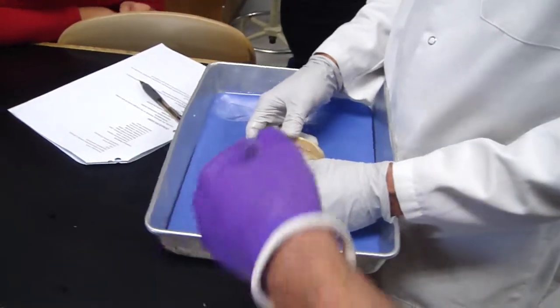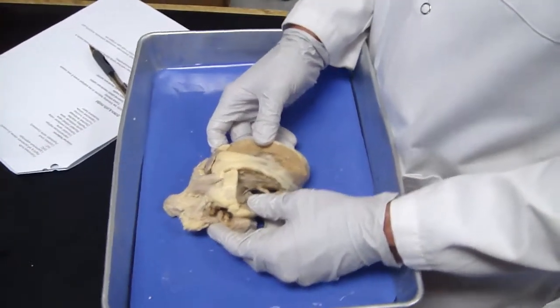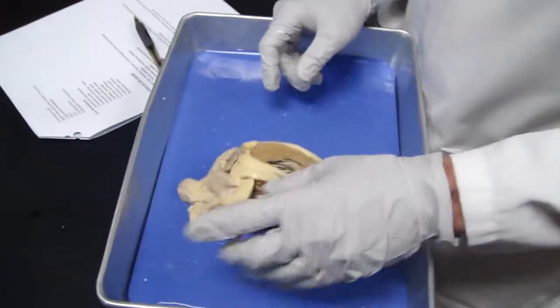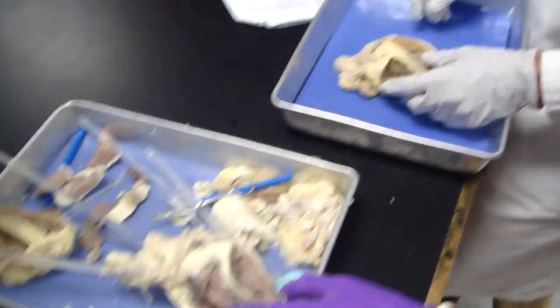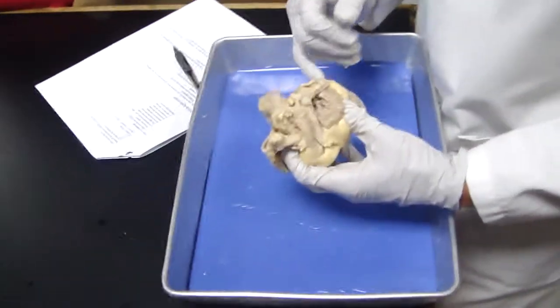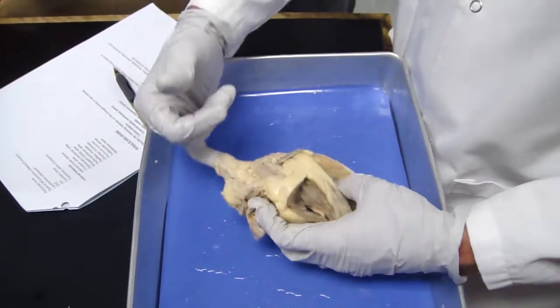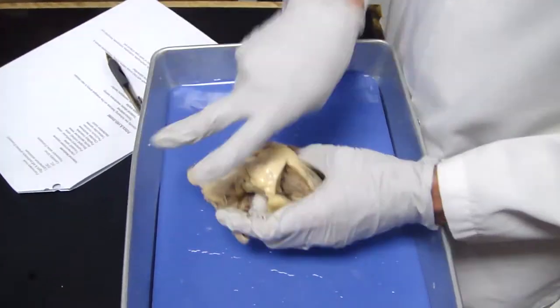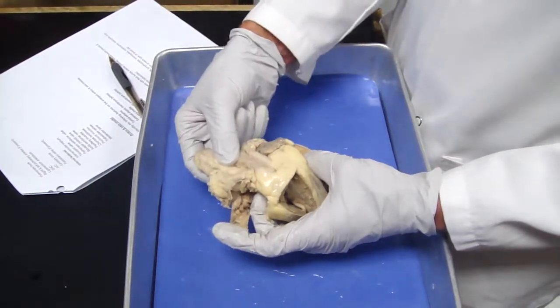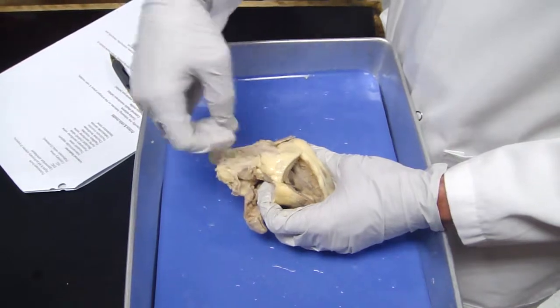Can you just show us, because I'm not sure if we're going to be responsible for veins and stuff. Great vessels that we can see, and I would use rods. So if I shove a rod in here, and you can see where it's poking out, and then I shove a rod here, you should be able to figure out, all right, this is aorta, and those two are touching, that's why I put the rods in there.